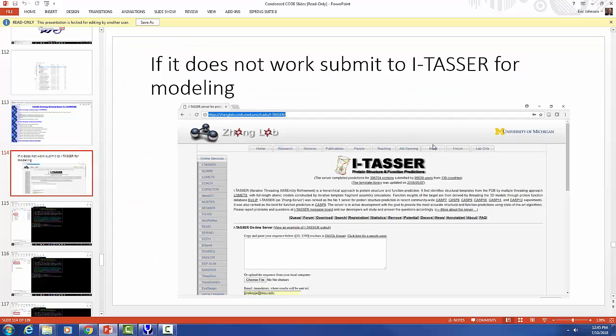As probably mentioned before, there's I-TASSER, which is a program that does something similar. It will produce a PDB file based off of another method of producing three-dimensional structure. And so you can maybe use that for confirmation, or if the YASARA program didn't work, you can produce a PDB file that way.